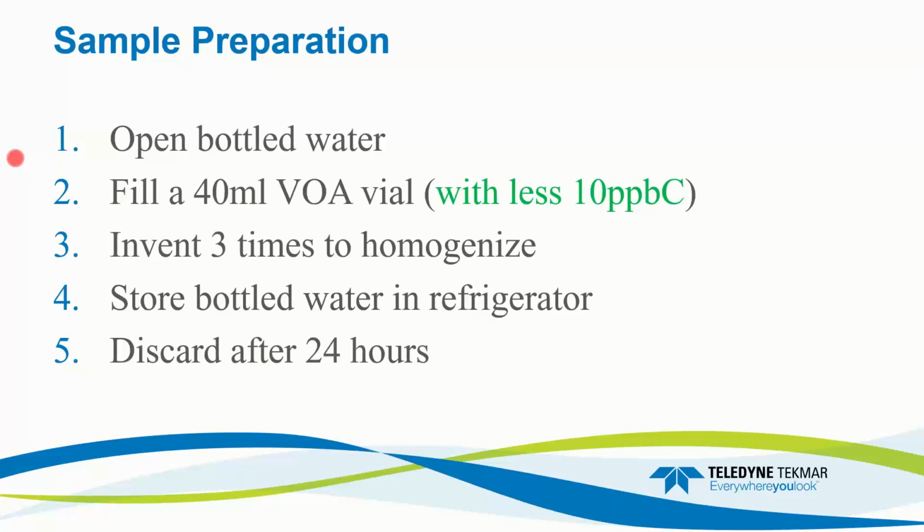Some laboratories like to preserve their samples with 1% phosphoric acid to extend sample lives. If your laboratory does this, we recommend reducing the amount of acid in the method parameters, because you have already acidified your sample to less than pH 7 for stabilization over time. But to remove inorganic carbon within the TOC process, you add acid to bring it down to a pH of 2 to sparge off that IC. So if you do have a preserved sample, we recommend reducing the amount of acid added within your system just to help with the sample a little bit better.